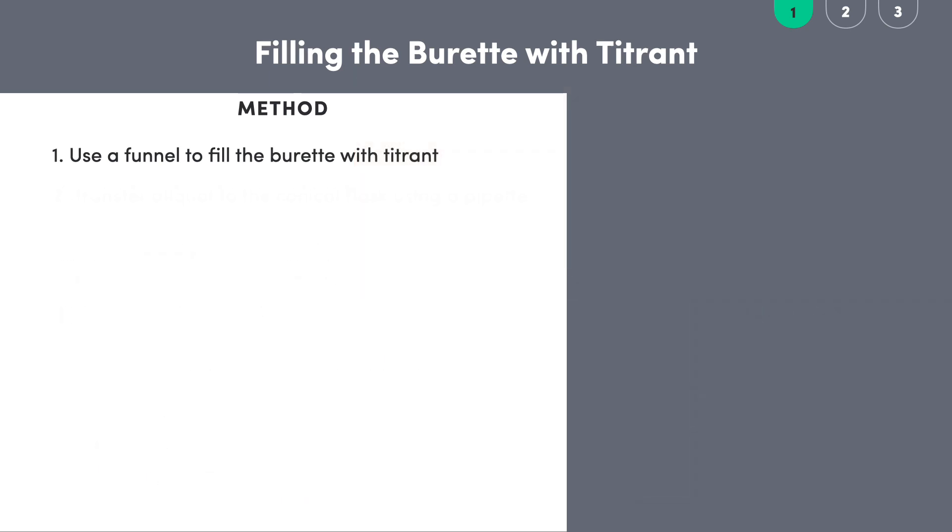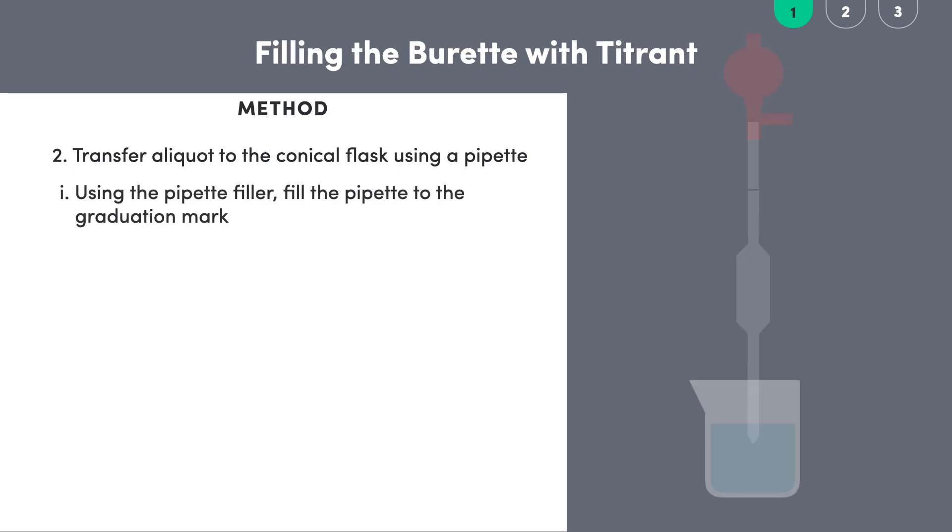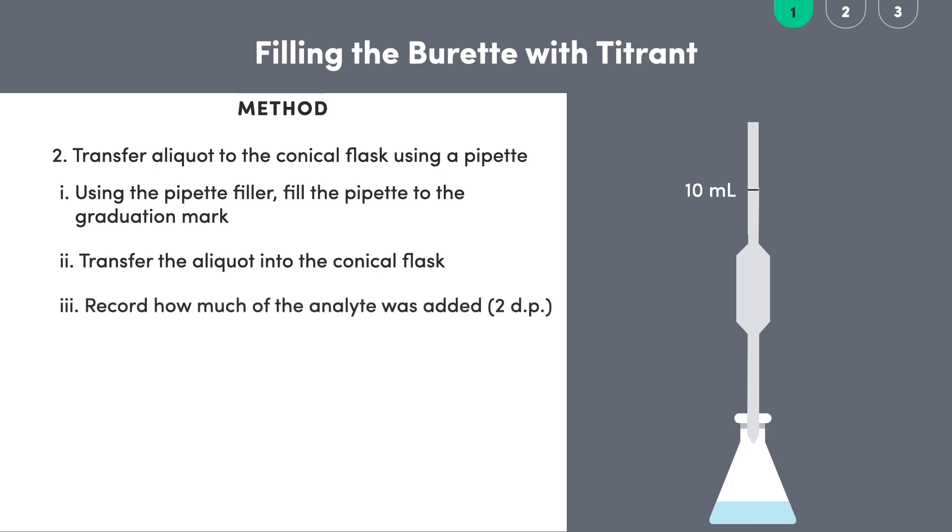Now that our burette is all set we'll move on to transferring a precise aliquot of sulfuric acid, our unknown solution or analyte, into the conical flask using a volumetric pipette. Filling the volumetric pipette with the analyte may require a bit of practice using a pipette filler which is basically a pump. We fill the pipette to above the graduation mark which indicates the precise volume of the pipette, in this case 10 milliliters. Then we gently release some of the solution until the bottom of the meniscus lies directly on the graduation mark. We then transfer this 10 milliliter sample of sulfuric acid into the conical flask by taking off the pipette filler, allowing the solution to run out of the bottom. In terms of the volume we record for our calculations, the pipette is precise enough to tell us milliliters to two decimal places, so here we can say we have added 10.00 milliliters of analyte to the conical flask.